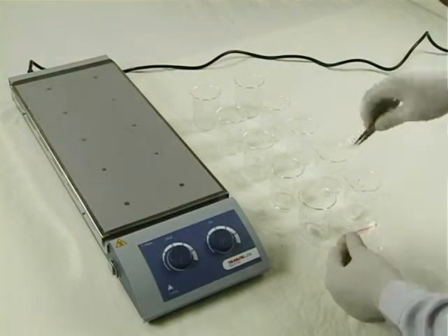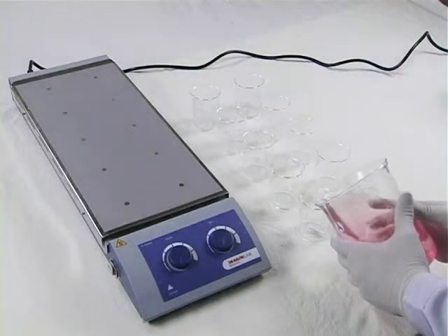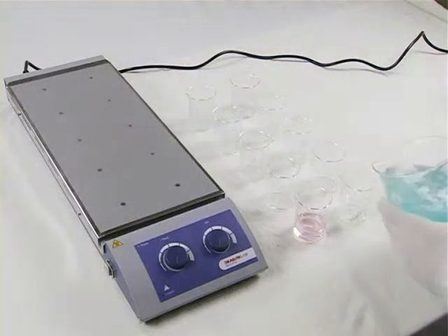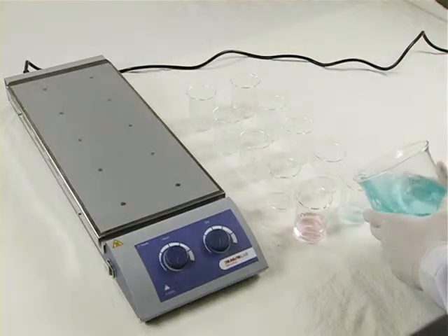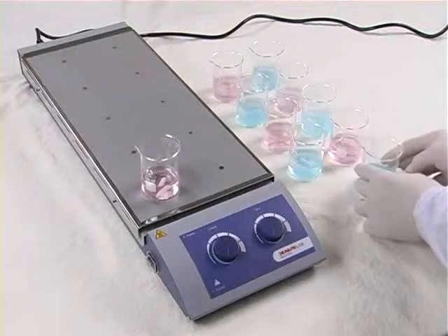Add the sample into the vessels with the stirrer bar. Place the vessels on the plate.